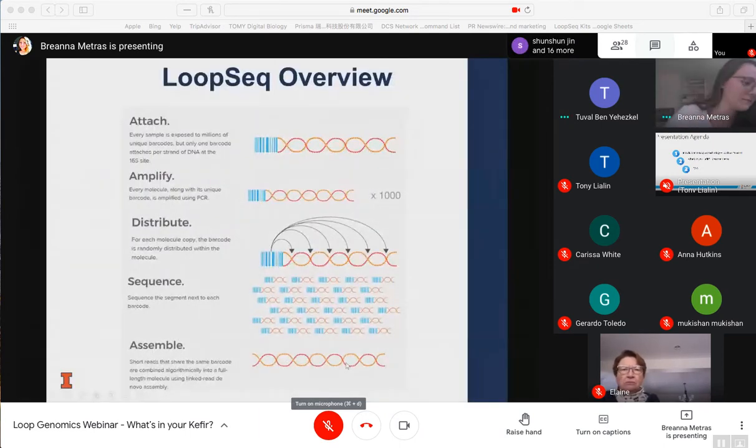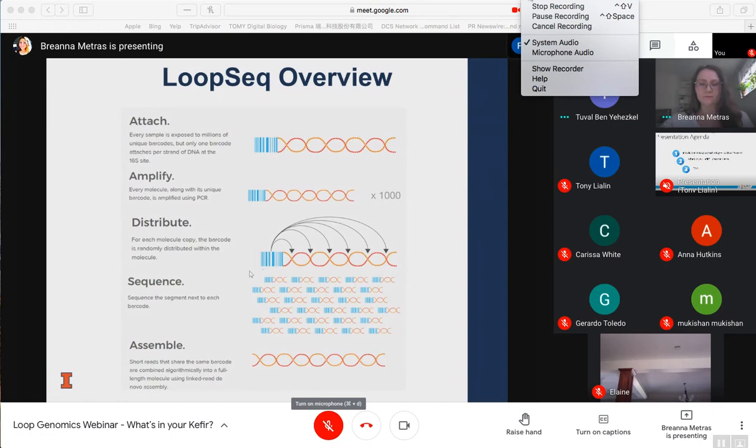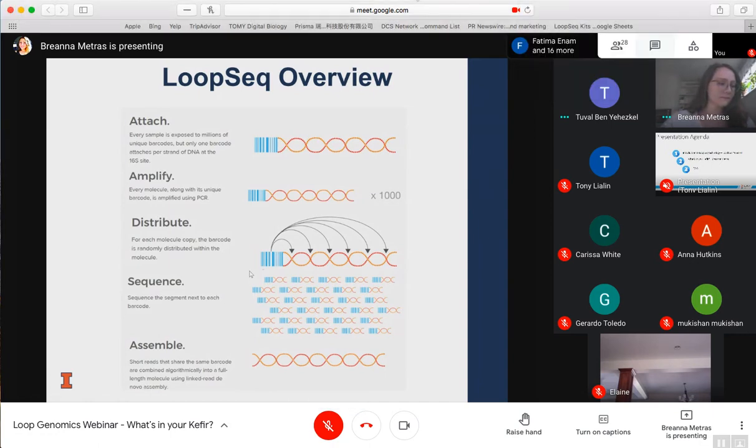Great, thanks, Brianna. Before Brianna starts, I'll just give a quick overview of some of the technology that Brianna used in her research. Brianna used a bunch of different methodologies. One of them was DNA sequencing in order to identify, classify, and quantify microbial populations. What was unique about the technology that Brianna used specifically in her sequencing work is that she employed long-read sequencing for determining microbial composition instead of the traditional short-read sequencing.